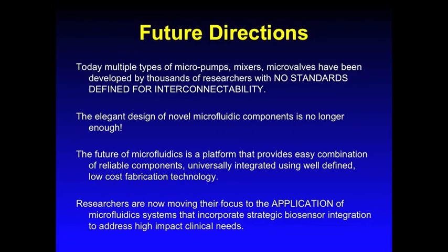Today, multiple types of micropumps, mixers, and microvalves have been developed by thousands of researchers with little to no standards defined for interconnectability. It is no longer enough to design an elegant microfluidic component. The future of microfluidics is a platform that provides easy combination of reliable components universally integrated using well-defined, low-cost fabrication technology. Researchers are now moving their focus towards the application of microfluidic systems that incorporate strategic biosensors to address high-impact clinical needs.